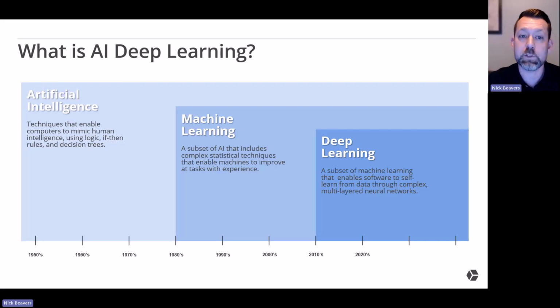So it is important when you're looking at options, again, it doesn't have to be imagepro, but when you're looking at different plugins for freeware or you're in the market for commercial products, ask them if what they're using is deep learning. It's actually going to make a big difference, and we hope to show you today some of those differences.